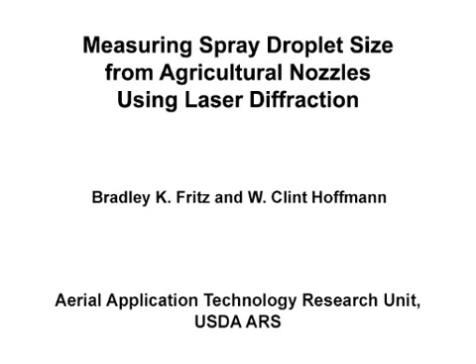The overall goal of this procedure is to evaluate the effect of nozzle type, spray pressure, and aircraft flight speed on spray droplets resulting from the use of ground and aerial application nozzles. This method can help answer a number of key questions in the application technology field related to the use and performance of spray nozzles used on typical delivery systems. The main advantage of this technique is that it gives a relatively quick and very precise measurement of a large number of nozzles and operational techniques.